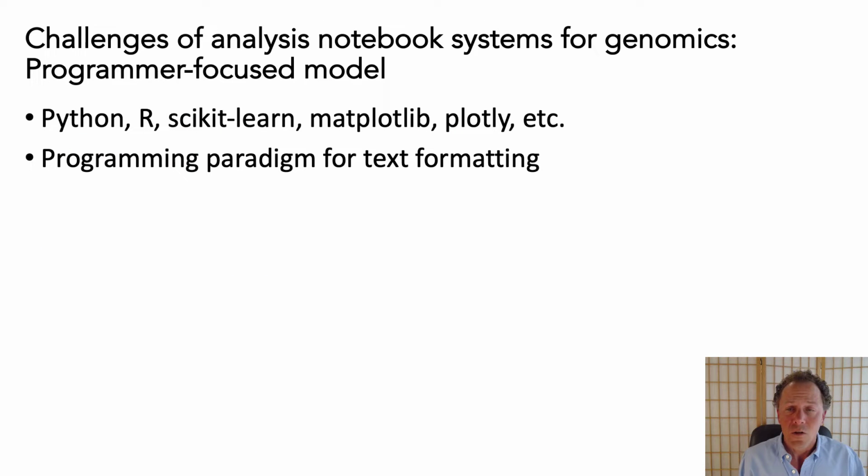The first is that notebooks assume that the user is a programmer. To use and understand notebooks, a scientist needs to have a background in a language such as Python or R, and familiarity with the packages that provide analysis and graphing functionality. Many biologists and bench researchers who could benefit from the features of notebooks are limited by their programming experience. This is especially true in cases where bioinformaticians share notebooks that are useful but require the user to modify the code to adapt it to their requirements, even if that's only to change the parameters of a function.